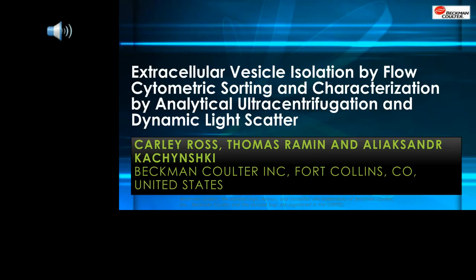Our next question: what size particles do you analyze using flow cytometry? Again, multiple answers are allowed here. Most people are studying particles between 100 and 500 nanometers in size using the flow cytometer. That's pretty typical. 25% of you don't know. 20% are between 500 nanometers to 1 micron, and 11.4% would be greater than 1 micron.